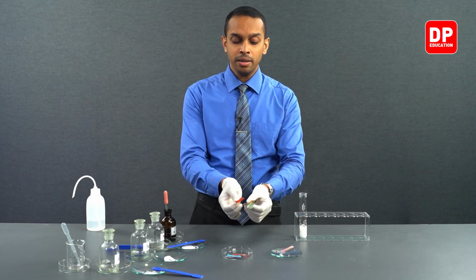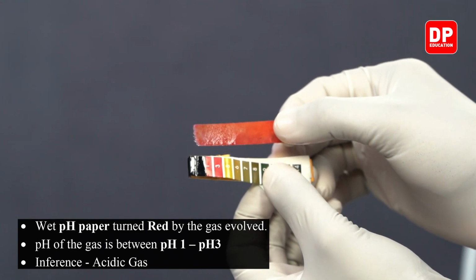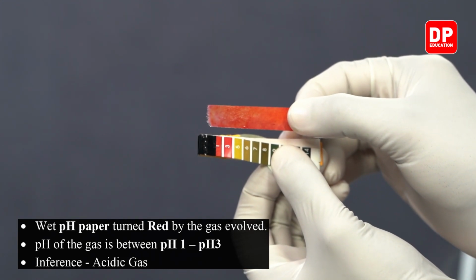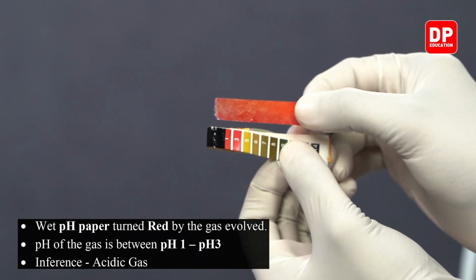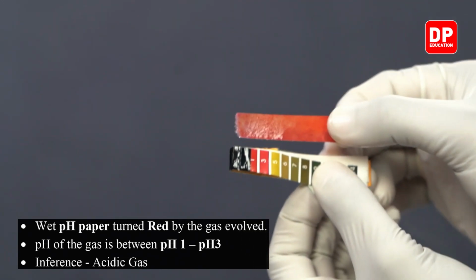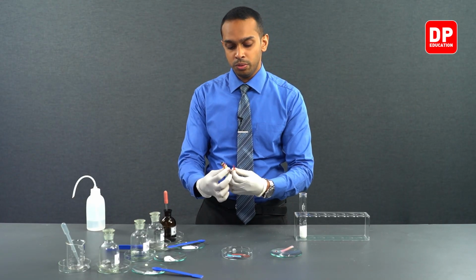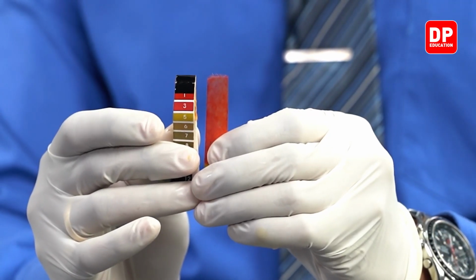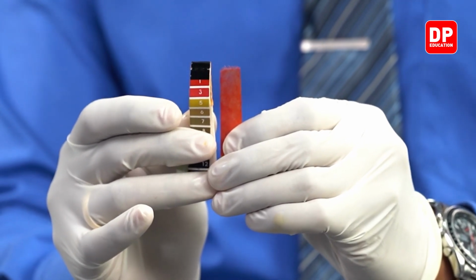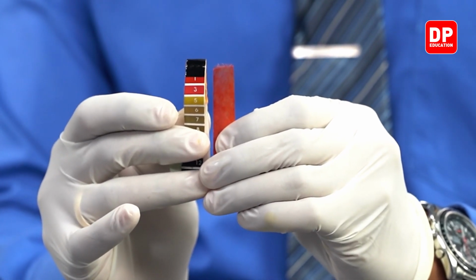So now if you compare the pH paper guide that is given over here, it's a bright red color, which indicates the pH of the gas that is released is between 1 and 3. So this is a highly acidic gas that is produced. If I show it to you over here, the acidic gas that is produced indicates it is HCl that was released when concentrated sulfuric acid was added onto a sodium chloride solid.